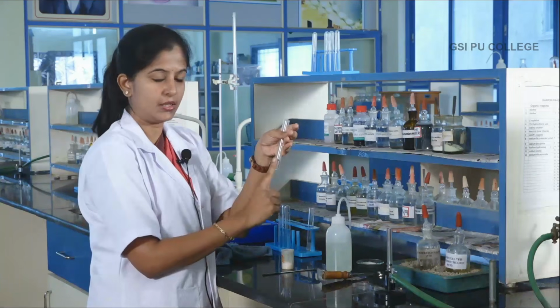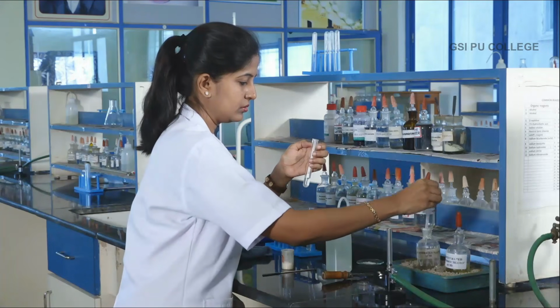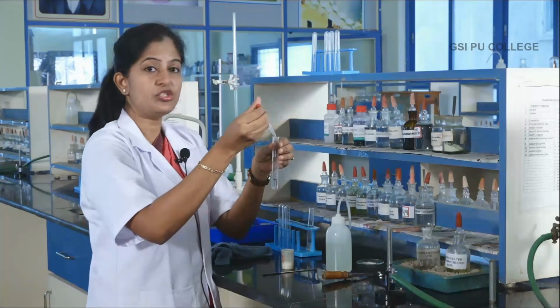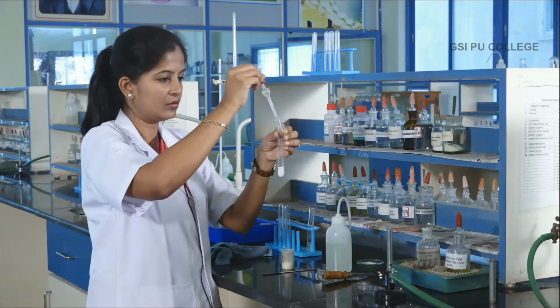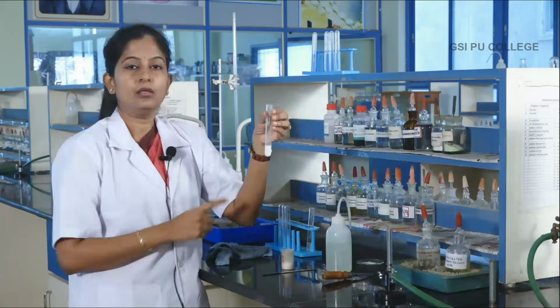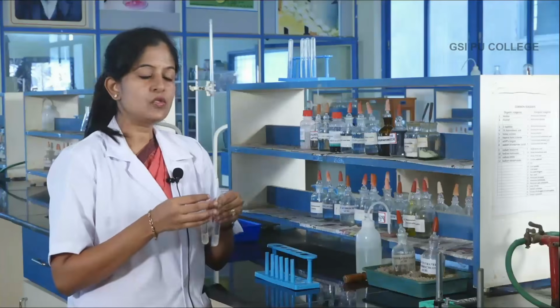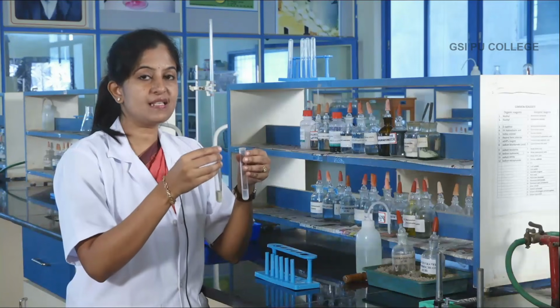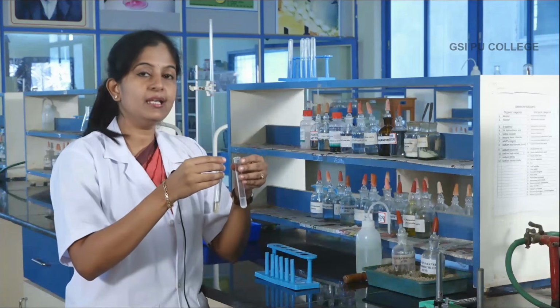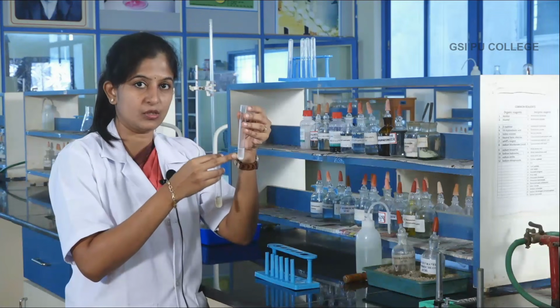To the salt solution, add concentrated sulfuric acid. Add the concentrated sulfuric acid along the walls of the test tube. Now, keep this test tube aside for a few minutes. So, after resting your original solution plus concentrated sulfuric acid for some time, now decant the ferrous sulfate solution that you have prepared previously, very slowly, to this mixture, that is the salt solution plus concentrated sulfuric acid mixture.